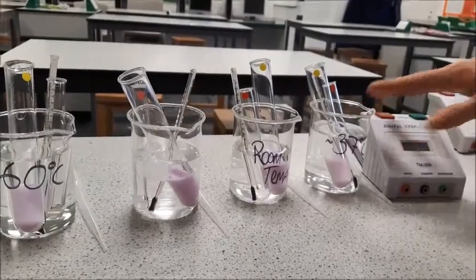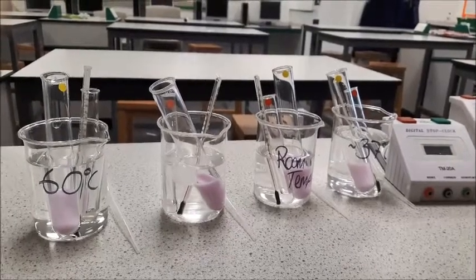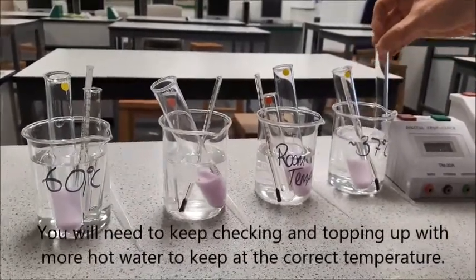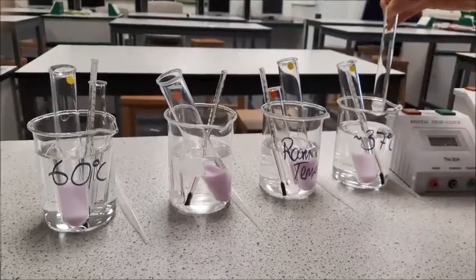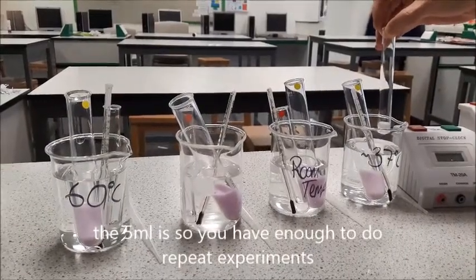This one is our 37 degree water bath. You're going to need to use a kettle and mix that hot water with different volumes of cold water to get to the temperatures that you want to use. Now we're going to mix 1ml of our lipase — we've just got the one millilitre that we're going to be adding to our milk, pre-measured out.